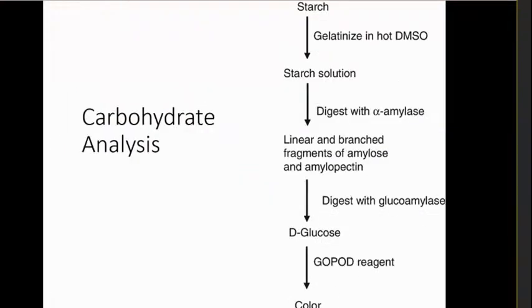Here, this is one of the widely used experiments for estimating carbohydrate. Another technique is where they use the glucose oxidase peroxidase reagent, but in some experiments they use the DNS assay or the phenol sulfuric acid assay.